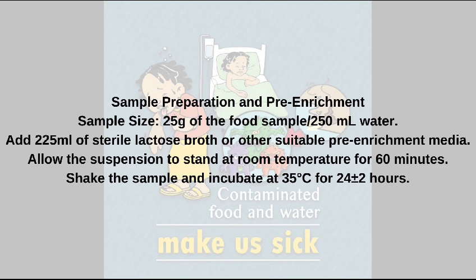Instead of lactose broth, there are various pre-enrichment broths which are used for different kinds of food samples. For example, if we want to analyze Salmonella species in non-fat dry milk and dry whole milk, then we can simply use sterile distilled water with 0.45 ml of 1% aqueous brilliant green dye, which should be added before incubation.